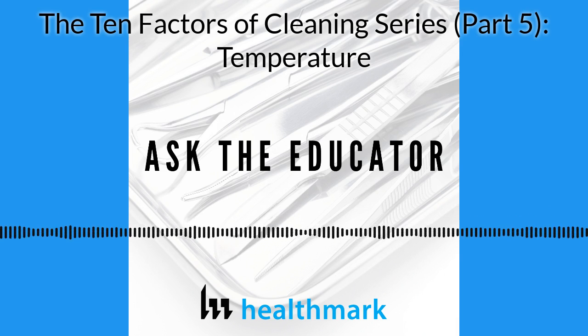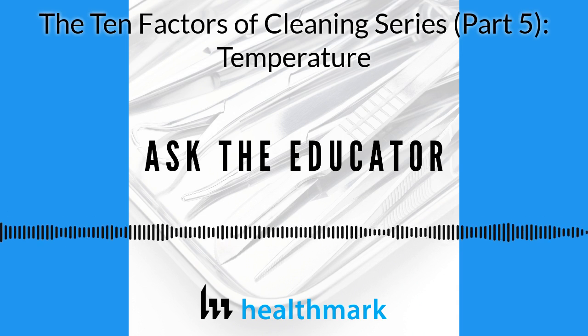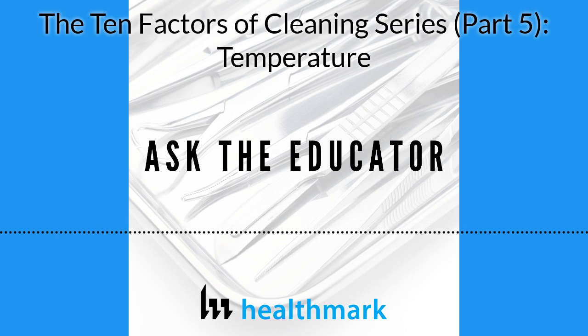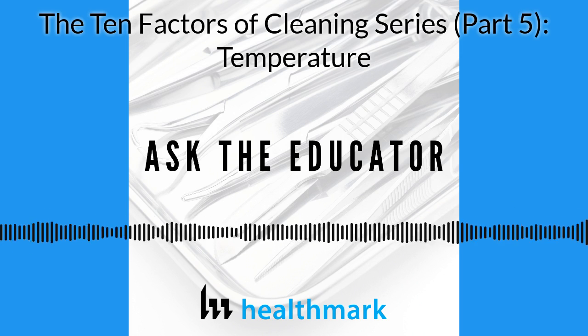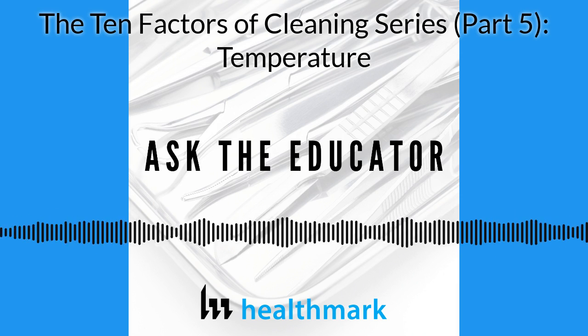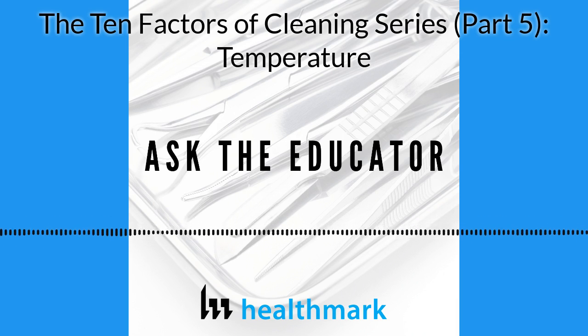So again, think of your cleaning solutions, and they have specific temperatures. And are you using the right temperature at each stage? In an automated washer, lower temperature to start to prevent denaturing, and then it gets higher later on to maximize the enzymes or your cleaning detergents.